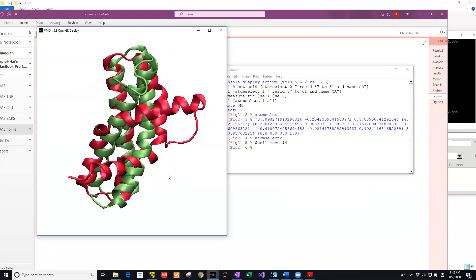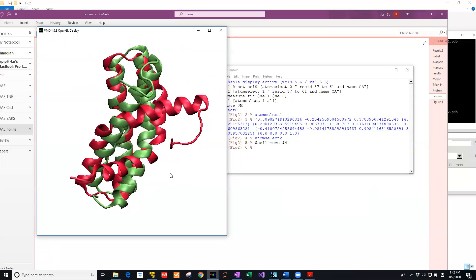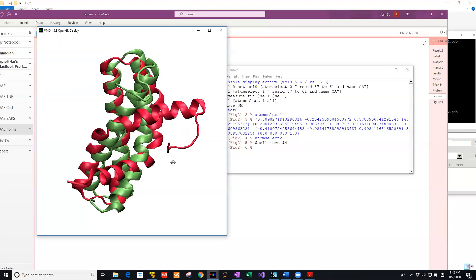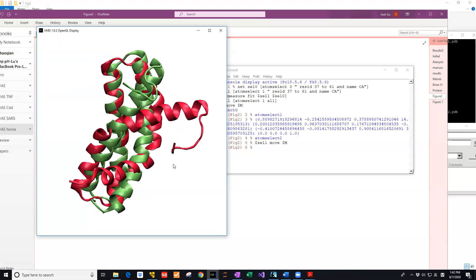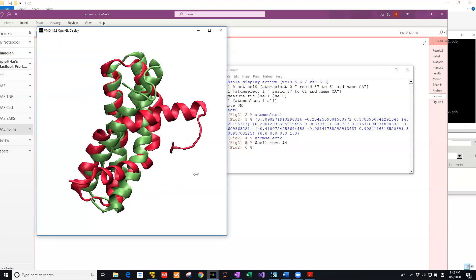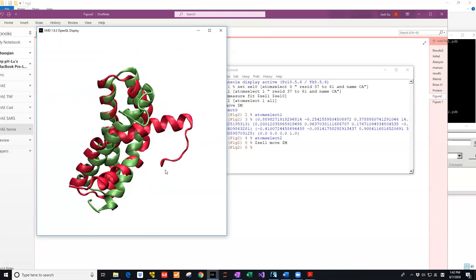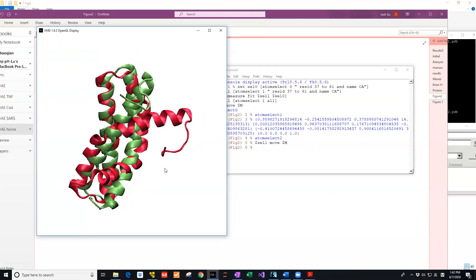If you want to do a translational move for the protein, press T on the keyboard and then you can move it. If you want to do rotation, press R. If you want to zoom in and out, press S — bigger or smaller. Press R on the keyboard to rotate the protein.